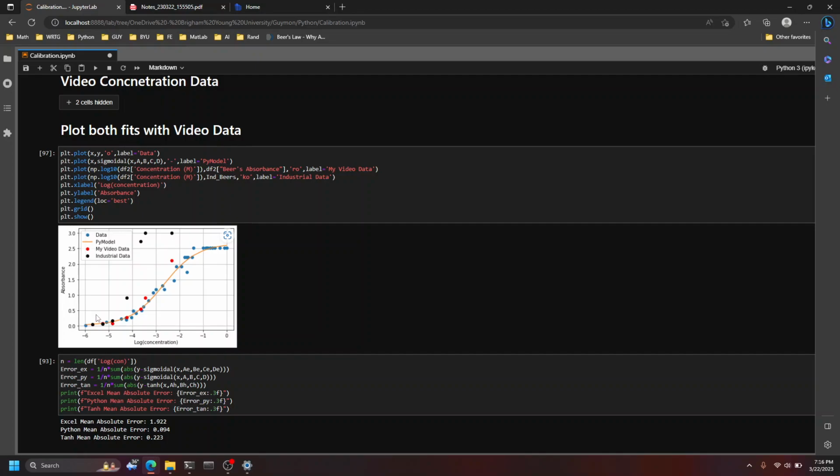This is why you always need to make sure that you have your upper and lower bounds to then be able to determine the absorbance which the concentration is going to give off. You're always going to have an upper and lower bound, while some spectrometers are going to do better at a wider range versus others that are going to do better at a steeper or a shorter range of concentration.